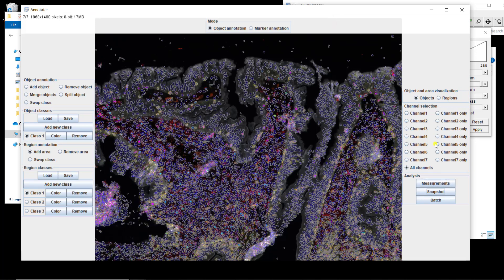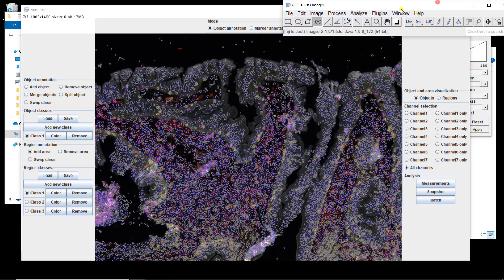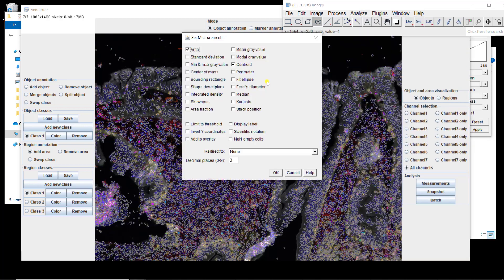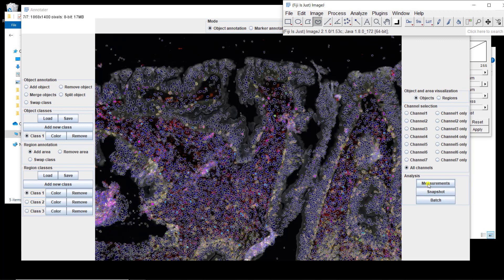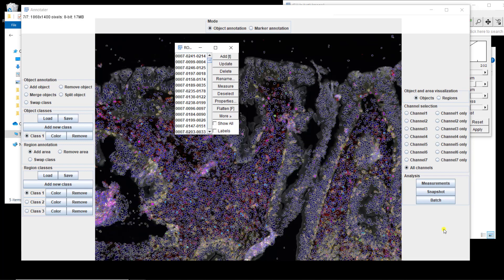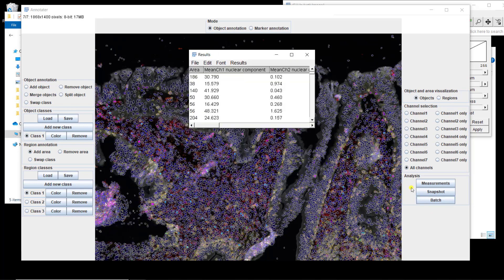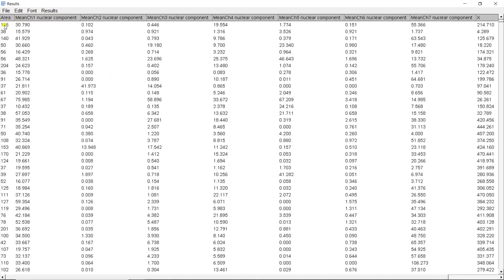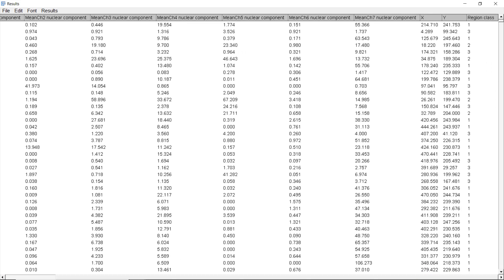Measurement actually extracts image features for each nucleus. When you hit that, it's going to extract features defined in 'Set Measurements'. So let's go to Analyze, Set Measurements, and define the features we want — for example, the area, centroid coordinates, and average intensity in each nucleus. Now I can do measurements. It opens a ROI manager and extracts those three features for each individual nucleus, putting them in a table when it's done. Each row corresponds to one nucleus — we have the area, then average intensity for DAPI, T-bet, CD8, ROR-gamma-T, CD4, FOXP3, and cytokeratin, followed by centroid coordinates.